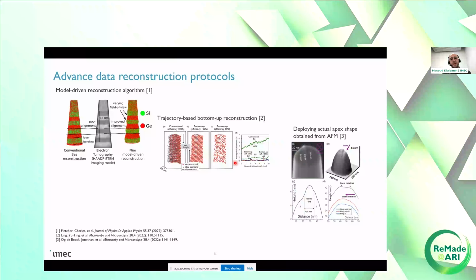There are even more advanced reconstruction protocols based on simulating the trajectory of ions, but these are really demanding in terms of computation. So many GPUs are needed. Sometimes the analysis might take many days. Nevertheless, for routine analysis, what exists right now can be used, and some deep insight can be extracted from certain regions of the specimen.